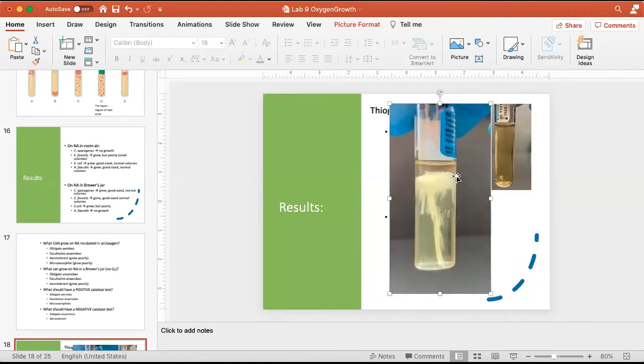This is what I mean when I talk about a big clump of cells right here, sort of like a big mat, a big collection of growth, all that cream-colored mass. And this is what I'm talking about when I talk about these strings. We don't see just nice cloudy media. What we see are these strings, these strands of growth. And it's the extent of the strand that you want to evaluate.